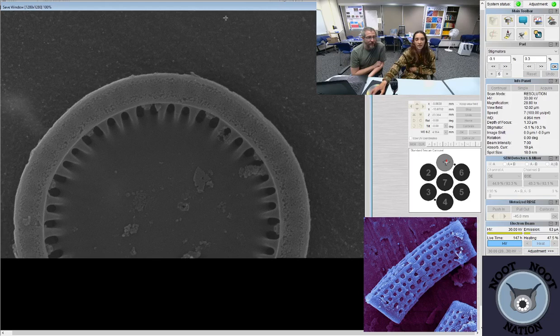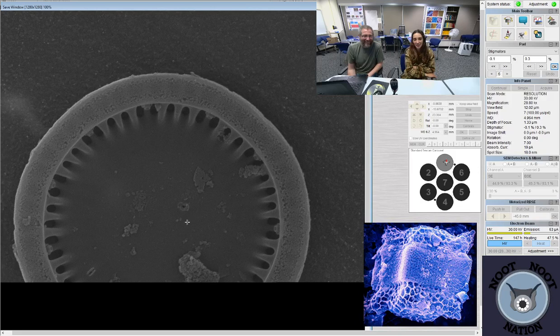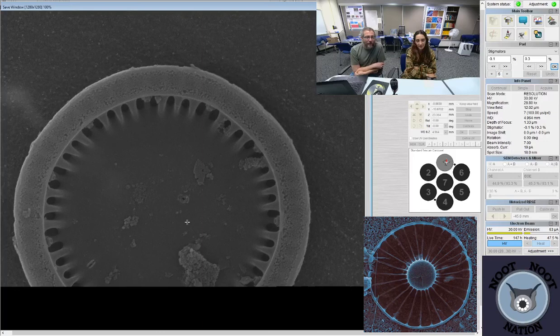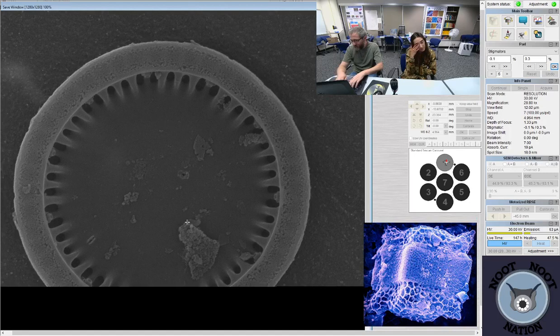Yeah, that's definitely it. You didn't believe me at first? When it was closed up, it looked ugly. It's because it's got some clay on it. It looks very nice. It just has some clay, right where you want to see all the features. But this is the diatom Lindavia costei. It looks like a little zero with parentheses boundaries around it. So the genus that we've been looking at for these last two is Lindavia.